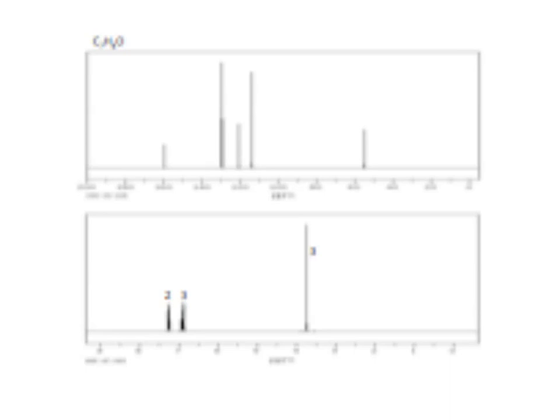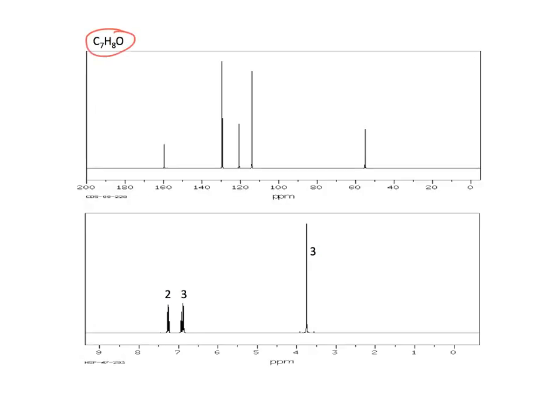All right, so now we're given a C13 spectrum and the proton NMR spectrum. Okay, we have a formula, C7H8O. Let's see, unsaturations equals 7 minus 8 halves, so that's 7 minus 4 equals 3, plus 1 equals 4. We likely have a benzene ring here, and because it's only C7, we're only left with CH3 left over, because we have 5 carbons around this ring.